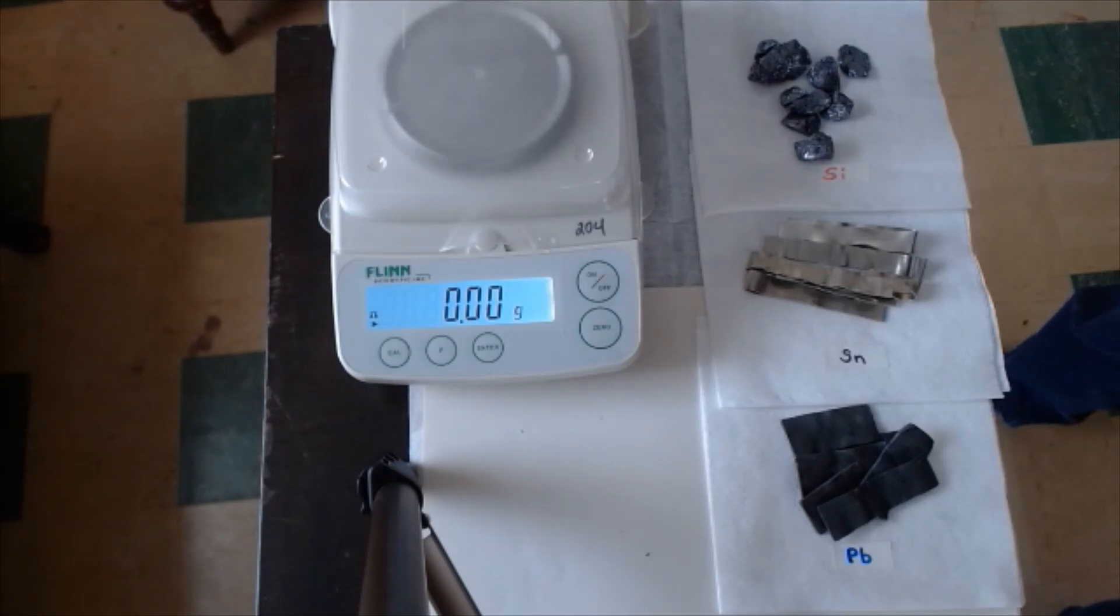And you'll plot the values that you've calculated from the previous page. This one is not going to be a straight line. It'll be sort of a best-fitting kind of curved line that you'll have to draw in as best you can.